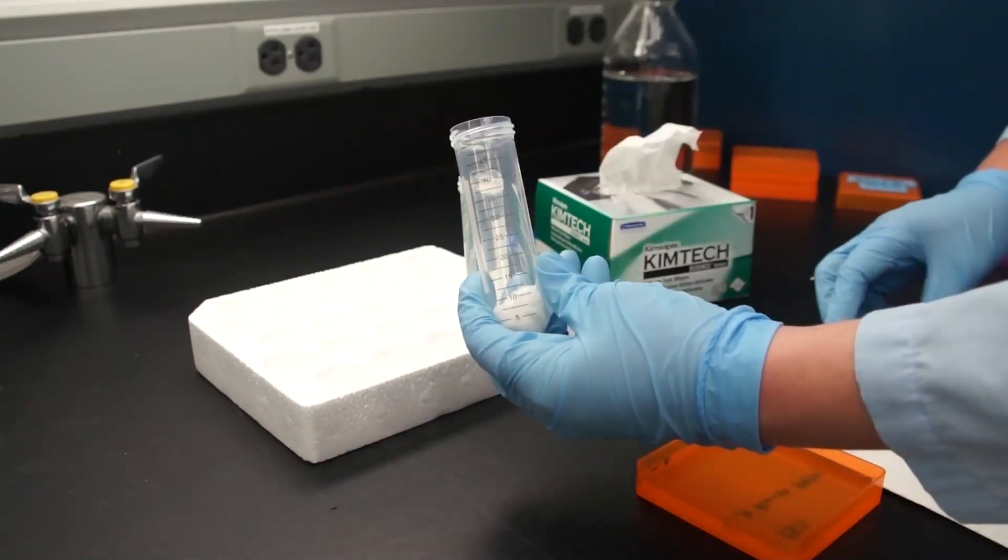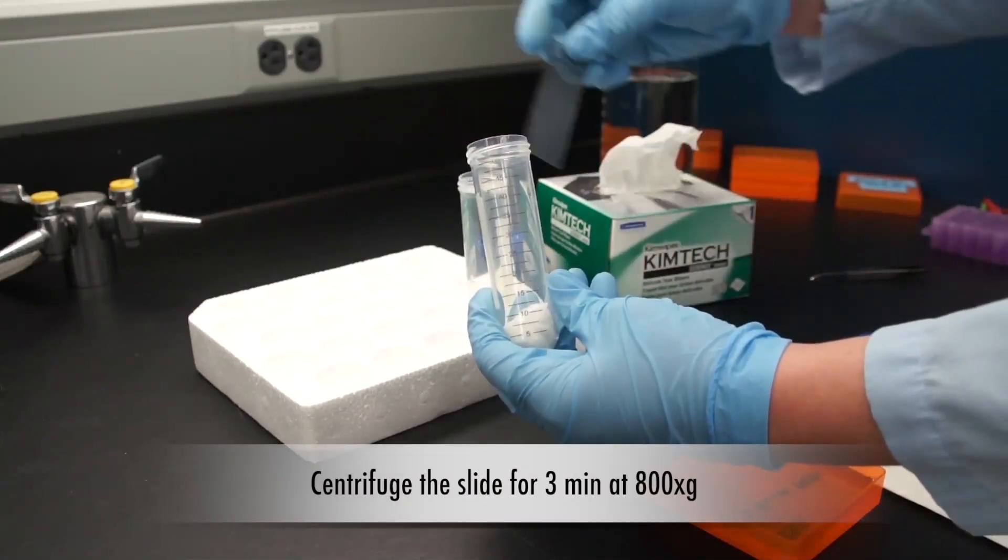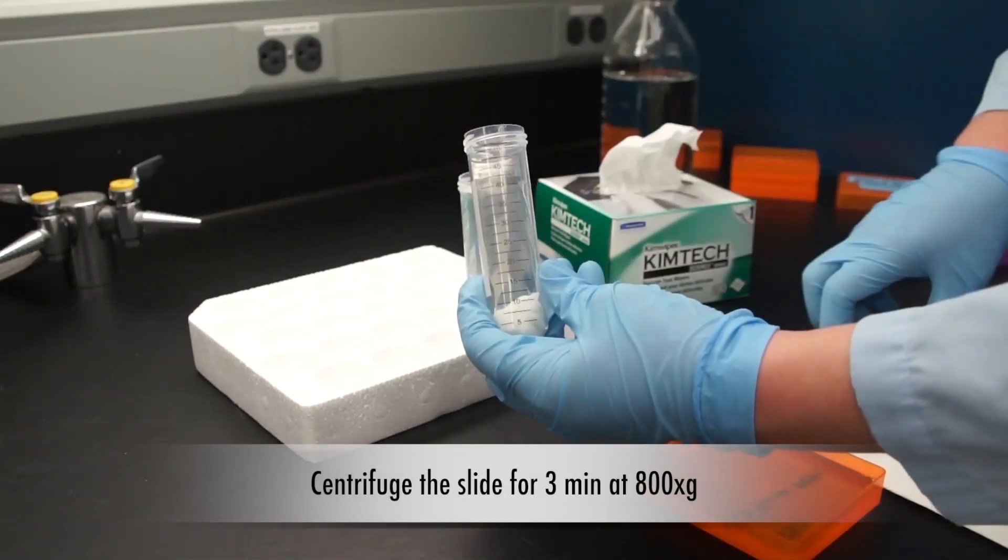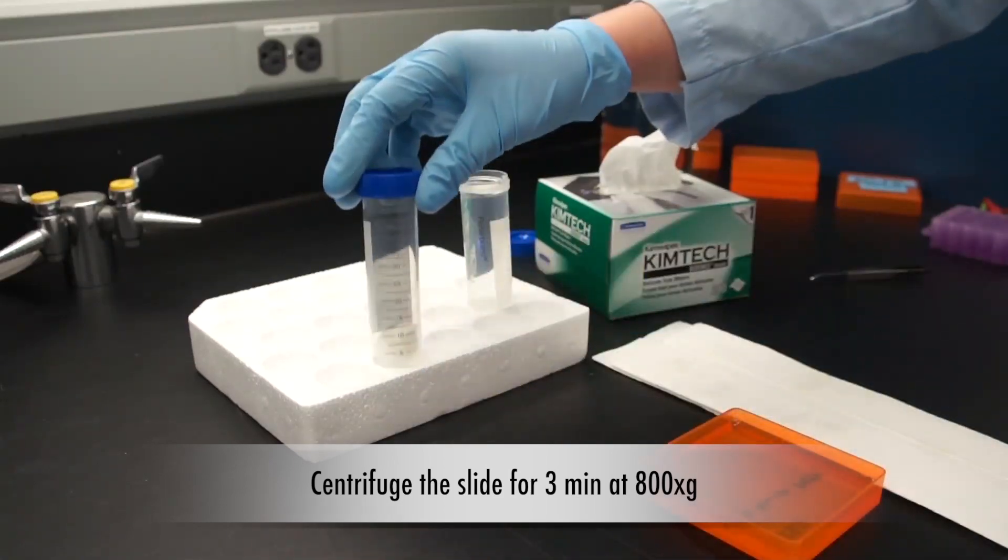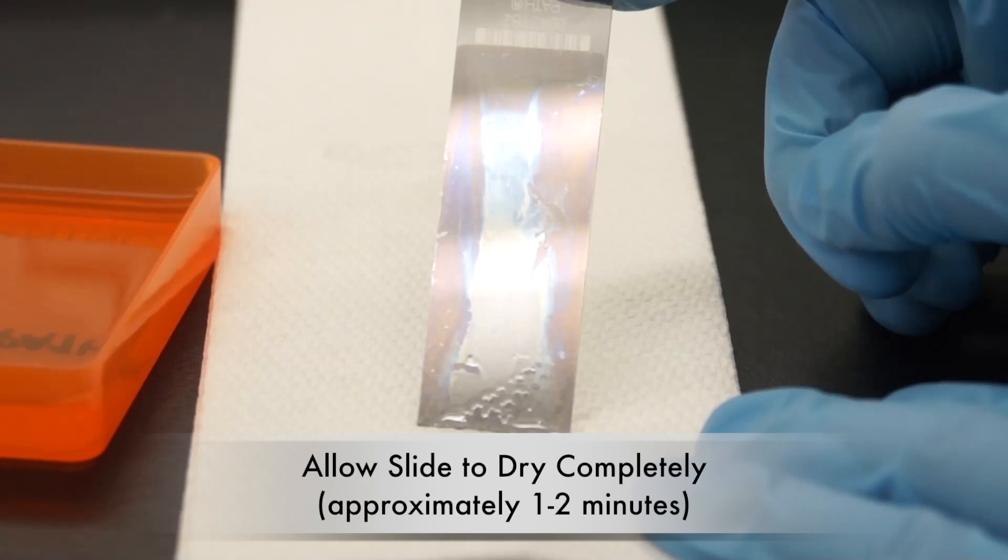Place your slide on top of the kimwipe and centrifuge it for 3 minutes at 800 times G. Allow the array to dry completely before scanning it. You will see a color change on the slide when it is dry.